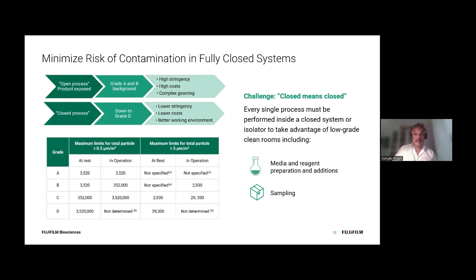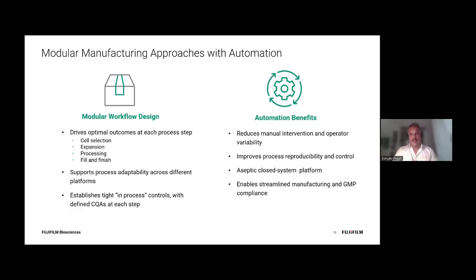And at the same time, there are quite a lot of interesting automation pieces that help people fully close and automate these process steps to achieve full control and full aseptic closed manufacturing, right?